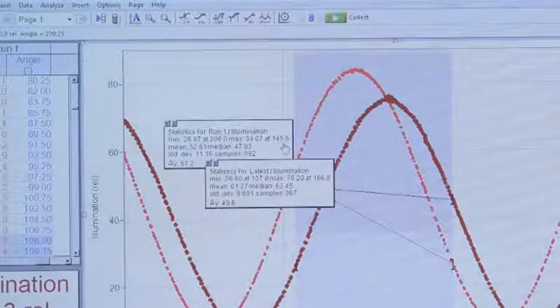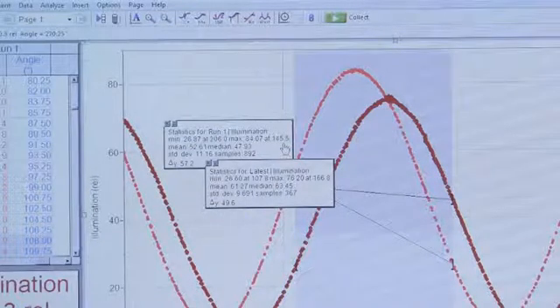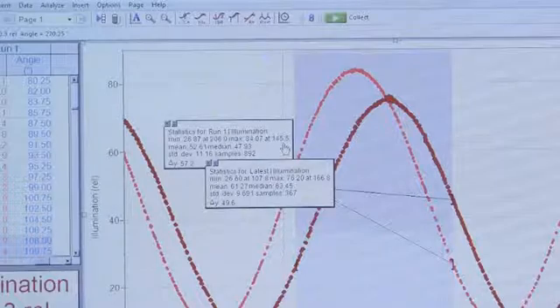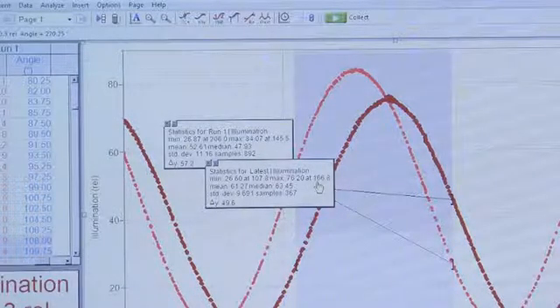For the blank it's 145.5 and for the sample it's 166.8.